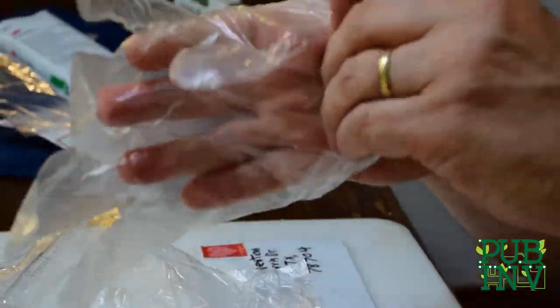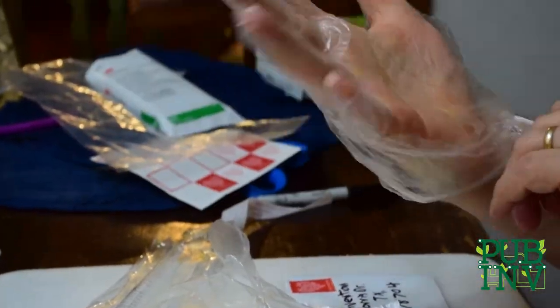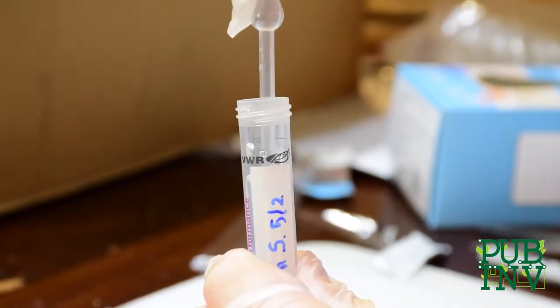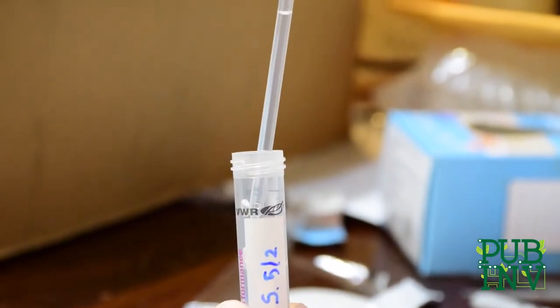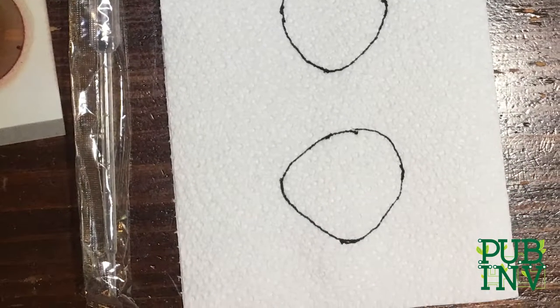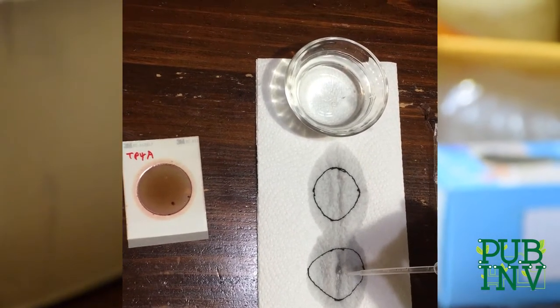Put on your gloves once again and prepare to add your samples as soon as possible after collecting. You can practice by using a pipette a few times beforehand with regular water and a bowl. Squeeze the pipette lower into the water and release. The goal is to collect the water level to 1 mL mark near the top of the tube. This may take a few tries at first, so you can draw a 3-inch circle on a paper towel and squeeze the pipette onto the center of the circle, which should fill out the circle.